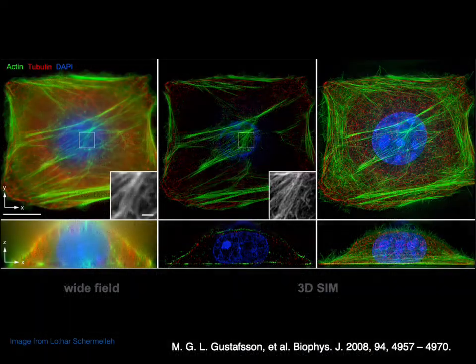Well, Mats Gustafsson did this in an excellent way. When he introduced structured illumination microscopy, he had clear in mind the kind of information he could add, superimposing on the details of the sample hidden by the diffraction limit some details that he knew very well using a resolution grid, and rotating this grid and taking advantage of the knowledge of this grid, he could reconstruct, as you see in the middle and on the right side, an image that shows you the cell and the components inside with a resolution that is unexpected. And in case you are playing with fluorescence in a nonlinear way, it could be unlimited.